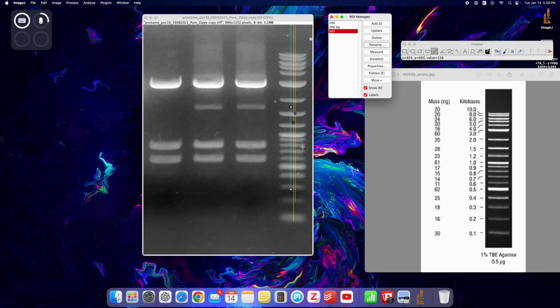So these have to be perfectly vertical to the horizontal lane here. Of course, I'm going to draw the lines in exactly the same way for each lane, for example, for 400, 500, 600, and so on. I will draw the different lines exactly the same, starting from 0, going down for these lanes, also in these particular wells in the gel. Let me get back to you when I finish that.